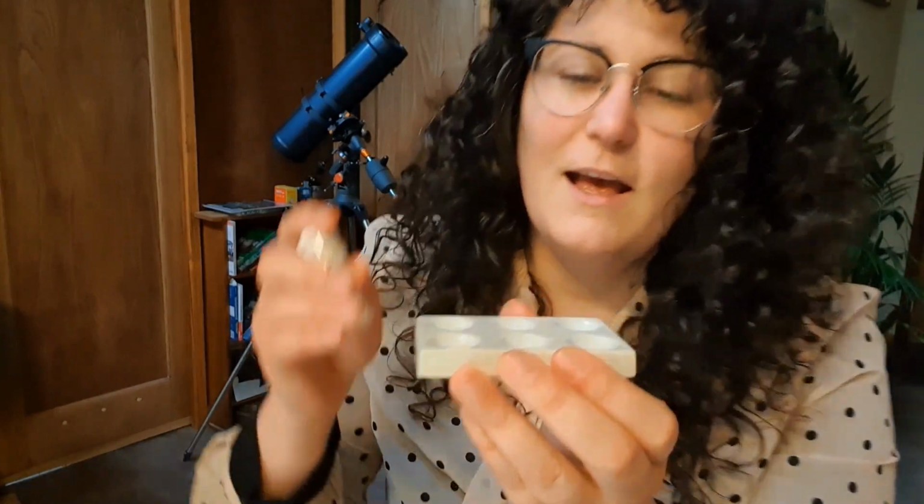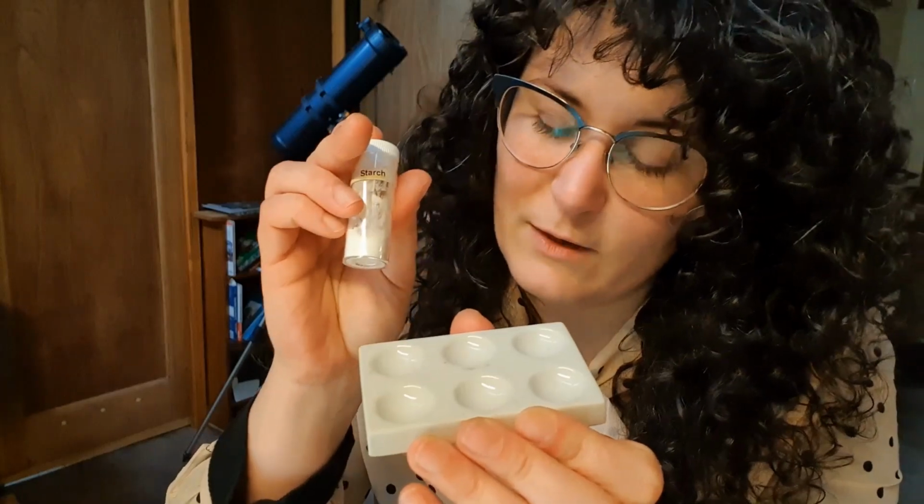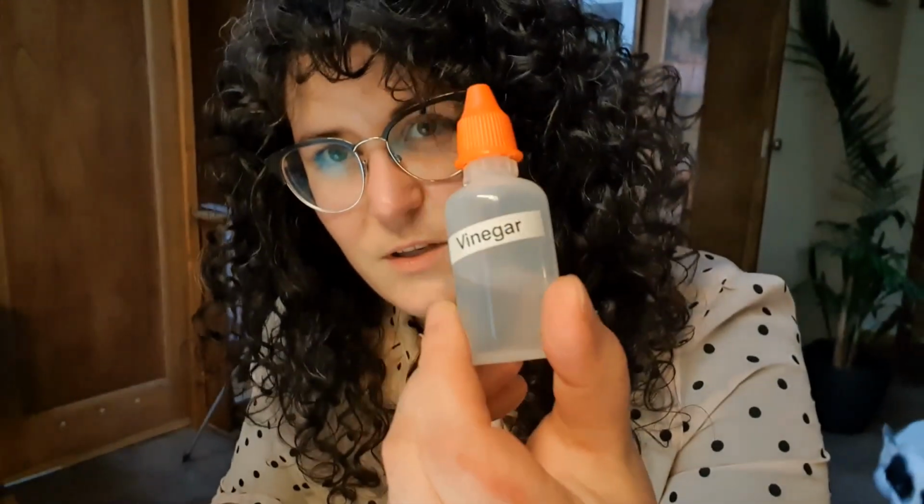All right, so what I'm going to be showing you is a range of powders and how they react to 3 different reagents. The way this prac works is I have this well plate, and I'm going to fill each well with a sample of each powder, and then I'm going to test each powder with the 3 different reagents. So we've got the iodine solution. Oh, it's a terrible label, sorry. Universal indicator, which tests the pH, and vinegar, which is going to do things to each powder, or maybe not do things. I don't know, we'll find out.